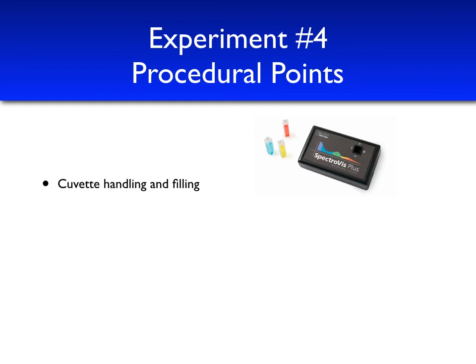One of the things that can cause damage to the spectrometer is liquids getting into the spectrometer itself. To minimize this, the cuvette should only be filled about 2/3 to 3/4 of the way, and a plastic cap should be used to minimize the risk of spills.